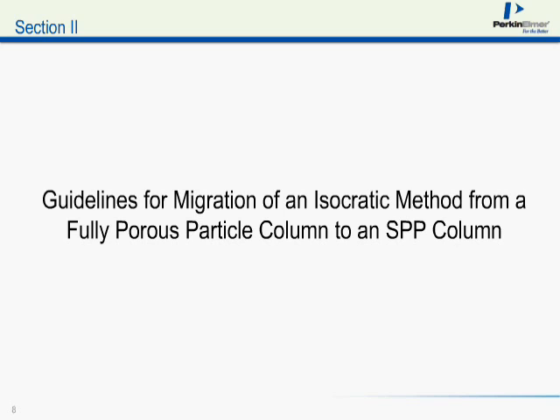So next we'll move into a method migration, and I'm going to step through a simple method migration for an isocratic method. This is with a mixture of UV absorbance for sunscreen.